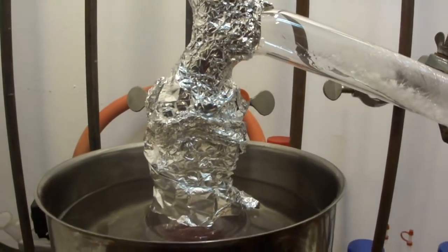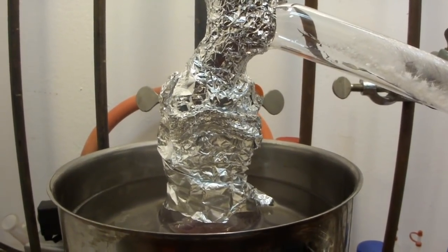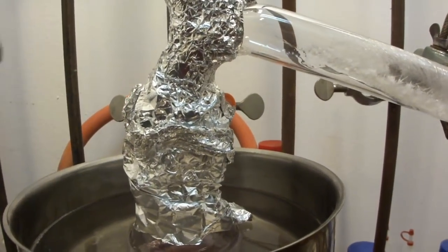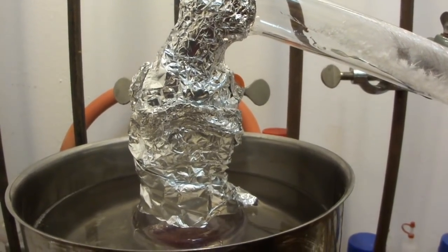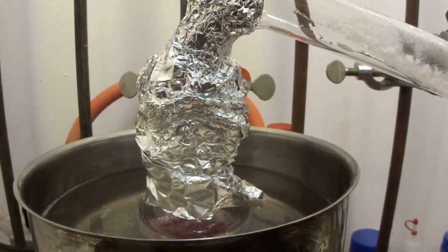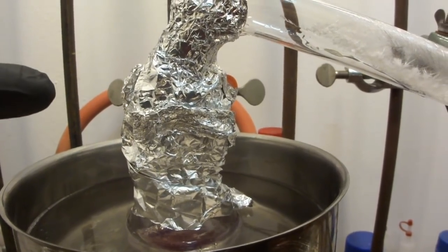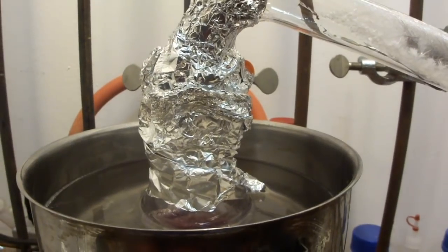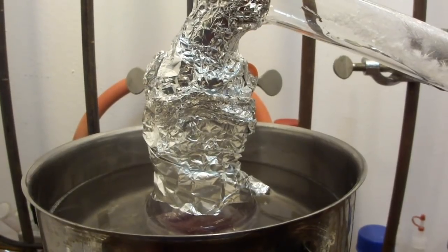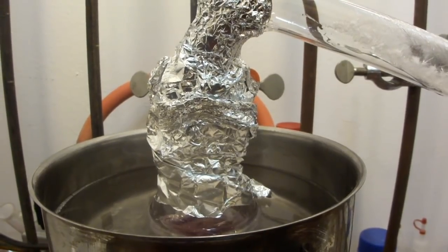And also a note for the new ones, anytime you do a distillation where you expect the compound to solidify in the condenser or also in the path up there, you have to be extremely careful to avoid blockage, especially if you insulate with aluminum foil and you can't see what's under there. So be extremely careful when dealing with compounds like this. So for example, acetamide, phenol are typical examples where you would do a distillation like this.